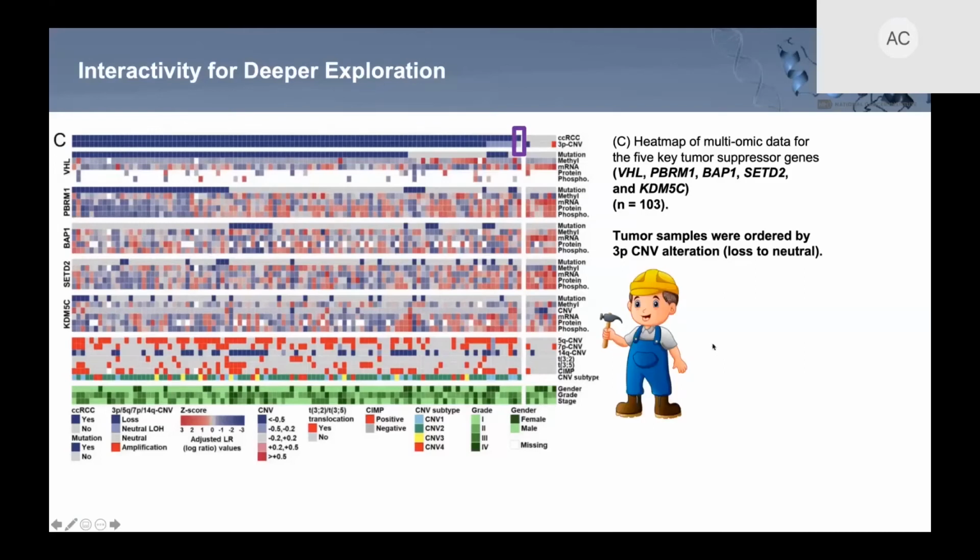There are only really two ways that I can think of, and they both entail downloading and accessing the data. The first way would be, once you have the data set, using it to code and create your own heat map. The next option would be to upload it to a more general platform, which can ostensibly generate heat maps for you. There are limitations to both these approaches.